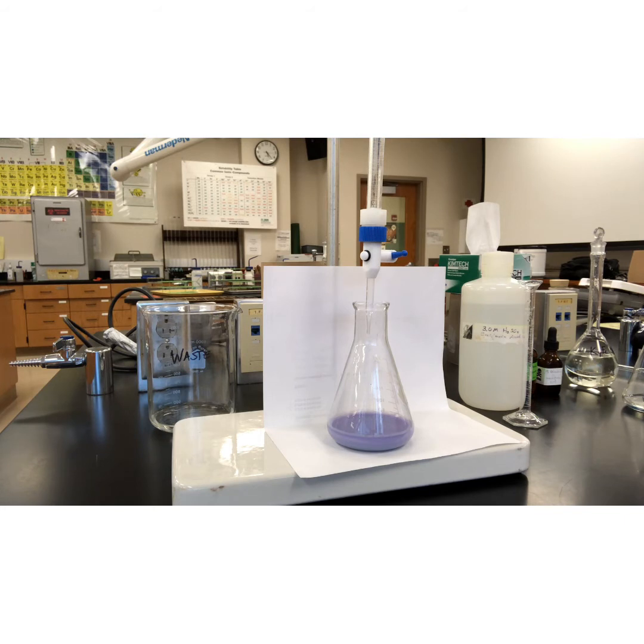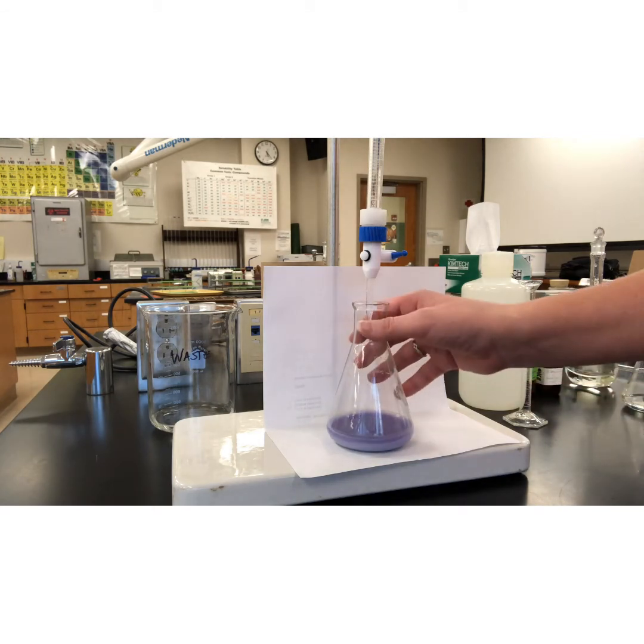Alright, so let's do titration 2. Maybe not. Maybe final. Now we're on the third titration. We're going to take an average of the 3. So there is titration 1.